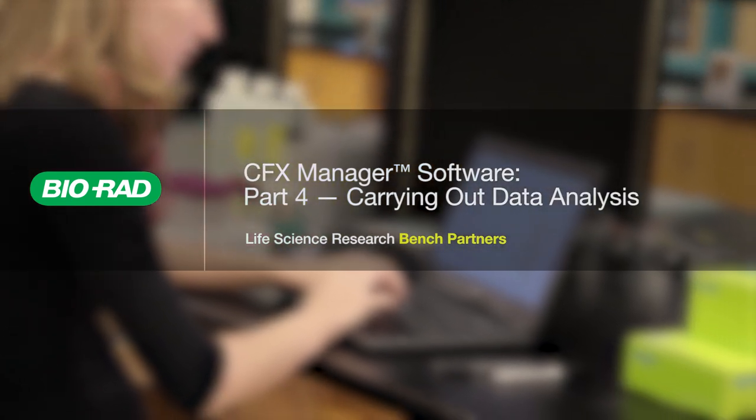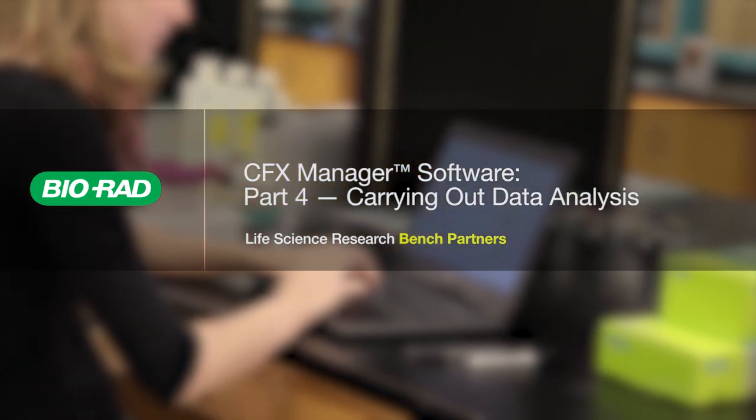After running a real-time PCR experiment, the next step is to analyze your data. But there are a lot of different ways to do that.